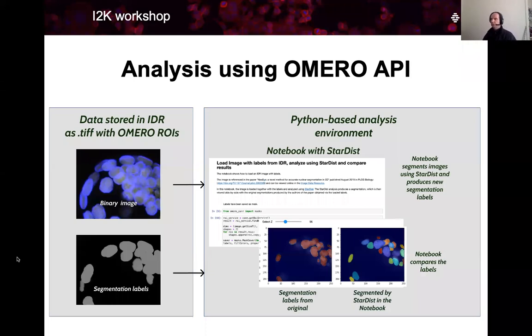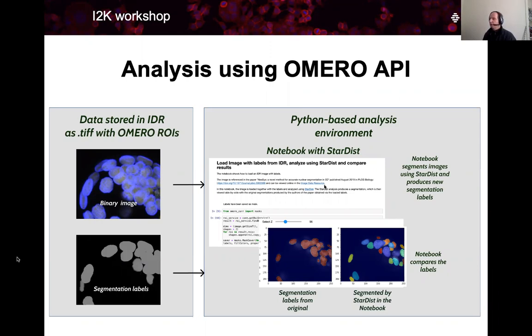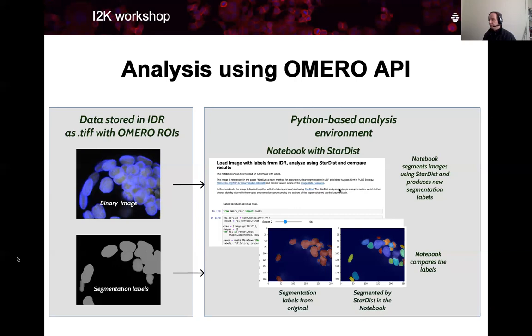So this is the second part of our workshop, analysis using Omero API. Omero is the software underlying IDR. It's an image management software, and we will use its application programming interface to programmatically fetch images and segmentation labels from IDR into a pre-built environment. It can be local or on the cloud. This recipe we will provide to you and I will explain to you in a second how to build this environment.